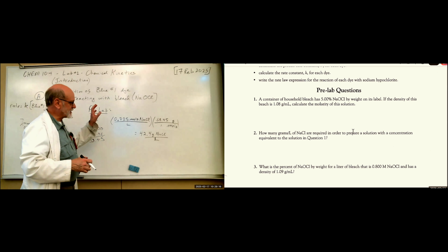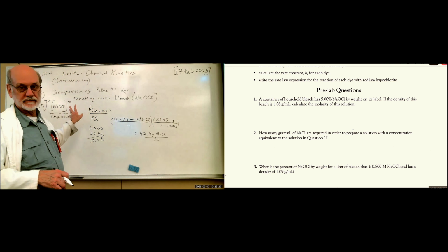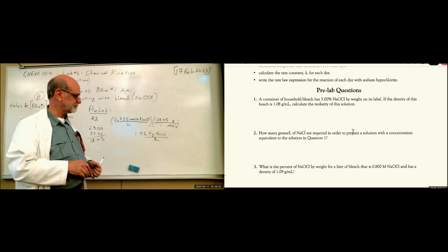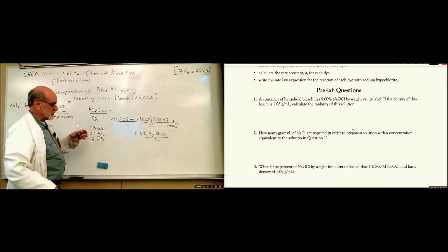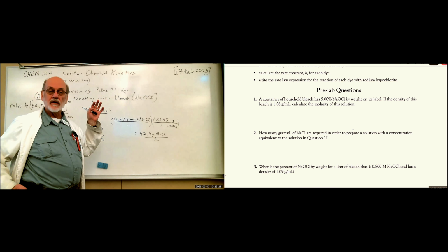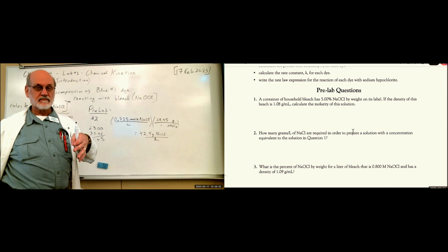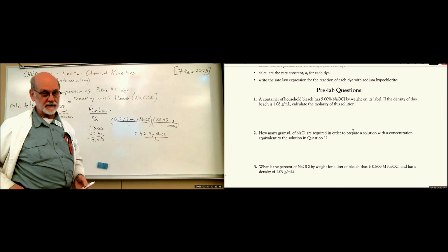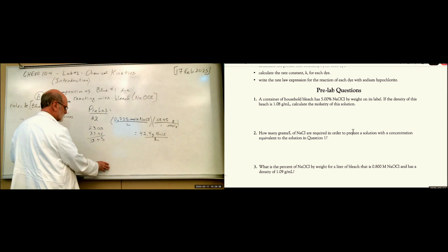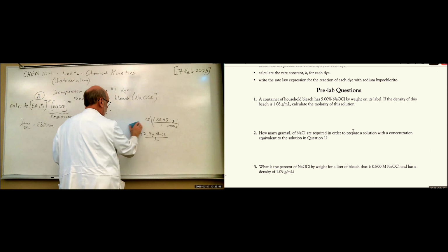That will give you the exact same concentration of sodium chloride as sodium hypochlorite. Now you'd have to do the same calculation for 6% sodium hypochlorite, because you're not going to use 5%, you're going to use 6%. So that requires a separate calculation to actually perform the lab.